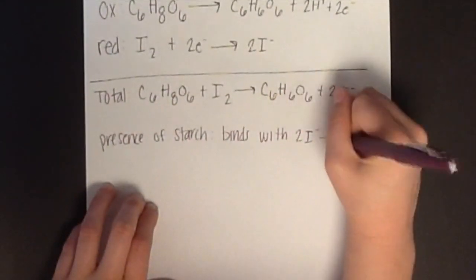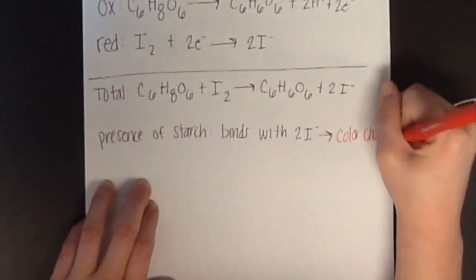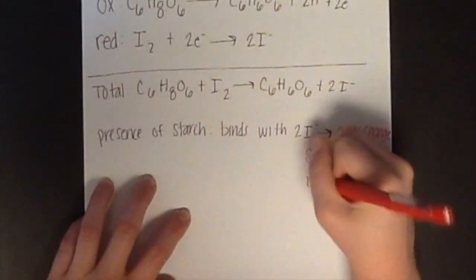In the presence of starch, the binding between the starch and iodine will cause a color change of the solution.